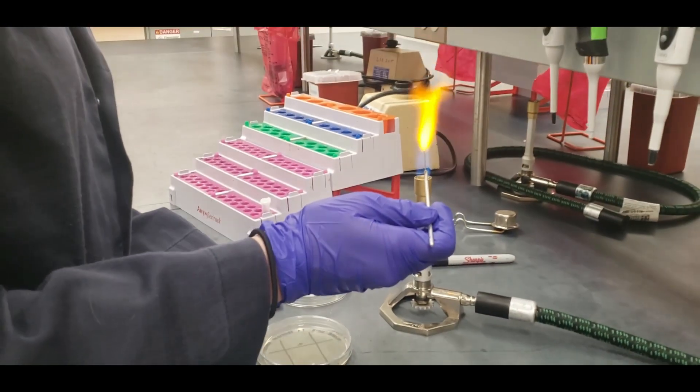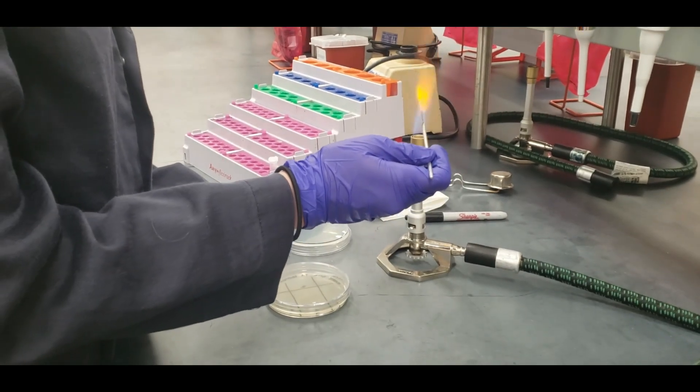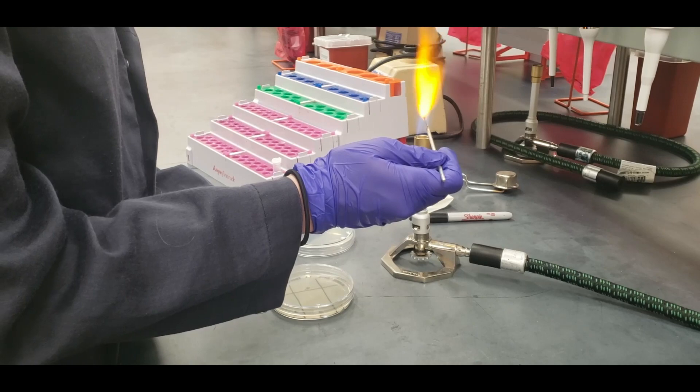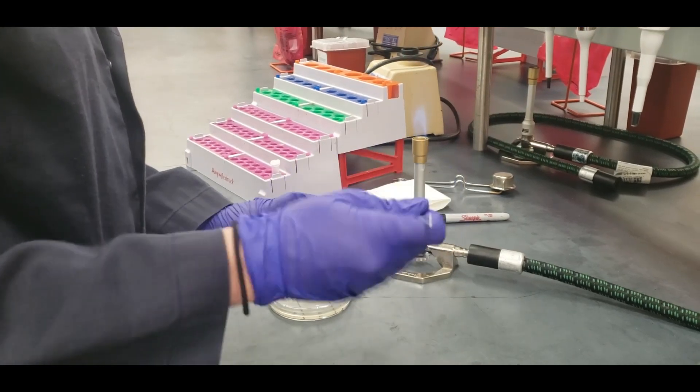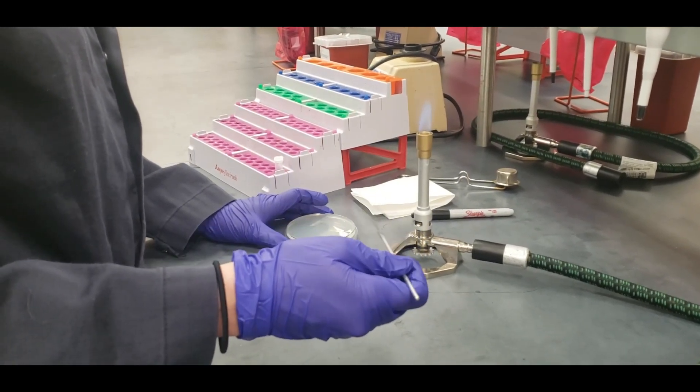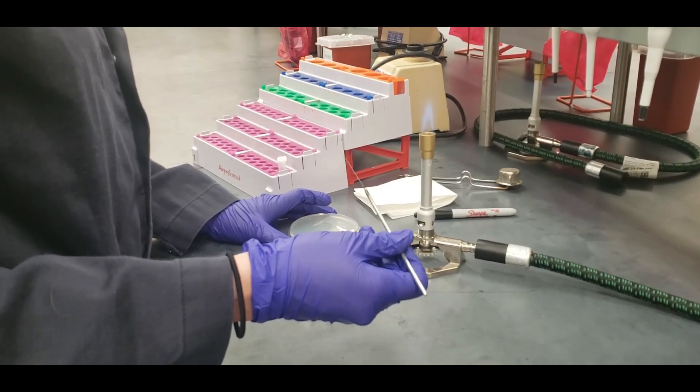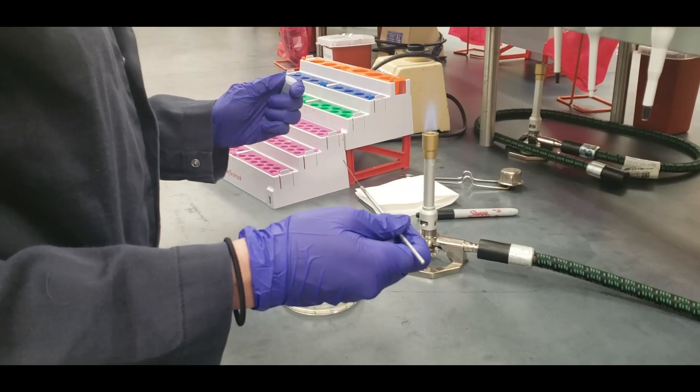You're going to sterilize your loop. And then you're going to make sure you let it cool all the way down so that when you stick it in the culture tube, you don't burn any bacteria. Make sure you work around the flame as well to prevent contamination.